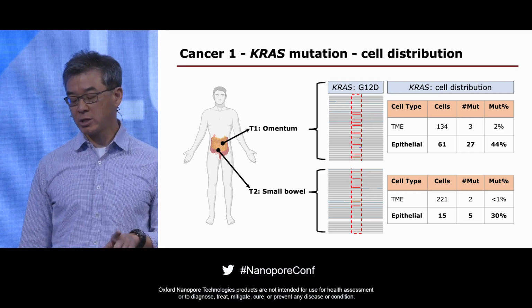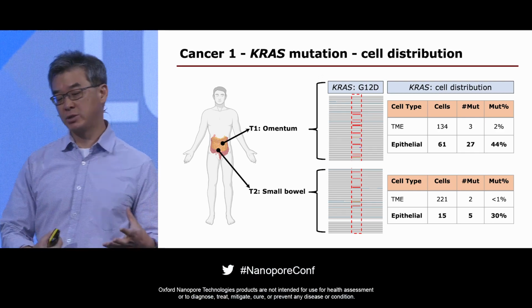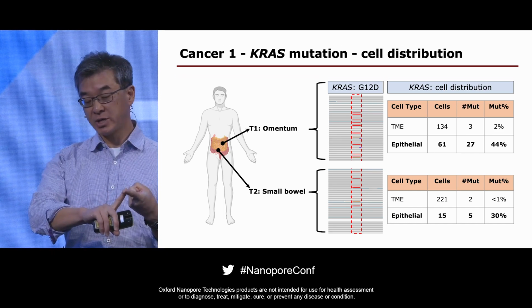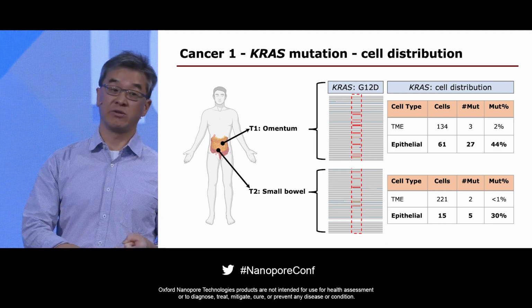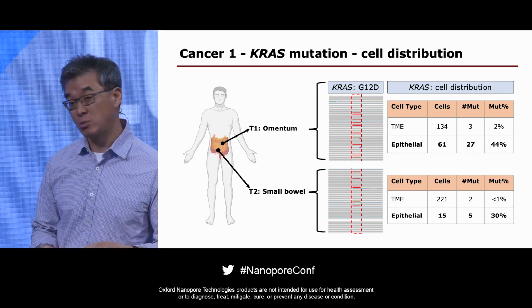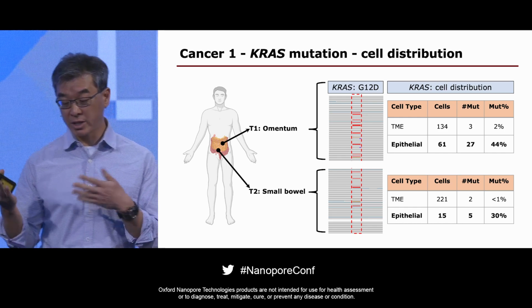And again, you can recognize that from all of this big garnish that occurs as part of an appendiceal carcinoma, we can recognize that there are epithelial cell types, find the individual cells that have the mutation using a very relatively simple strategy by overlapping and leveraging the Nanopore adaptive sampling long reads of cDNAs. And so that's recognized in both sites here.